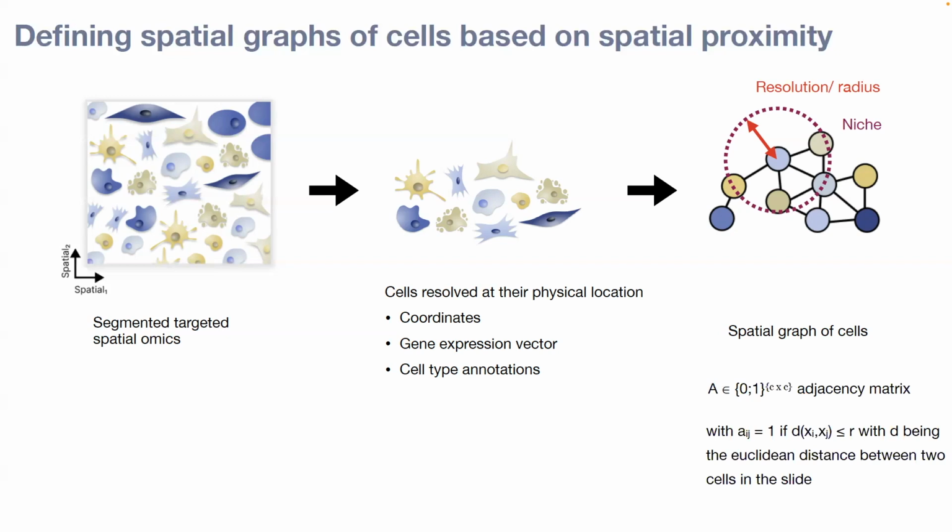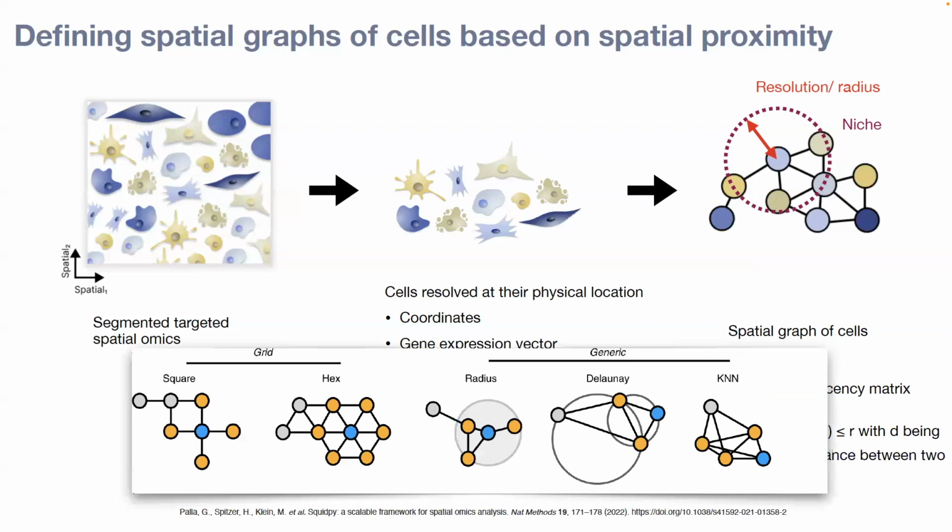Yeah, to give a bit of the mathematical background on why this concept is nice: it's really related to graph-based mathematics, where you have an adjacency matrix and define, just based on thresholding, essentially, if two cells are connected or not. There are multiple ways to build it if you, for example, don't want to use a radius, because you might not know if your interactions or dependencies happen at 10 micrometers, 20 micrometers, or 100 if you look into brain data. In this case, there are also various different sorts of graphs.